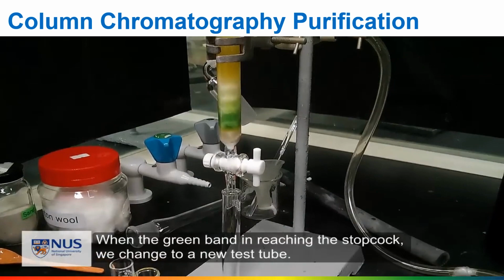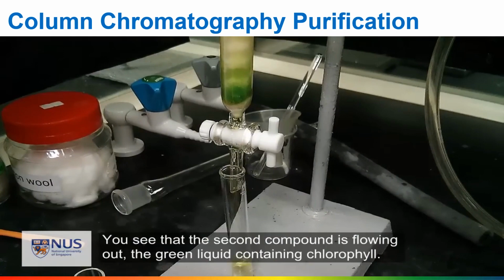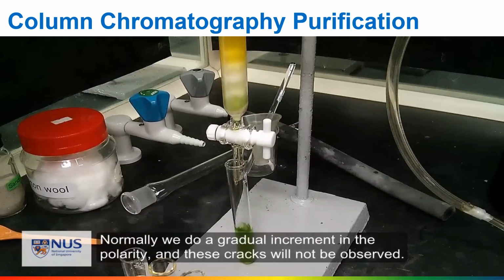When the green band is reaching the stopcock, we change the new test tube. You see that the second compound is flowing out, the green liquid containing chlorophyll. Here we change the eluent quite drastically from pure hexane to a 1:1 hexane ethyl acetate system, so the column may see some cracks. Normally, we do a gradual increment in the polarity, so these cracks should not be observed.